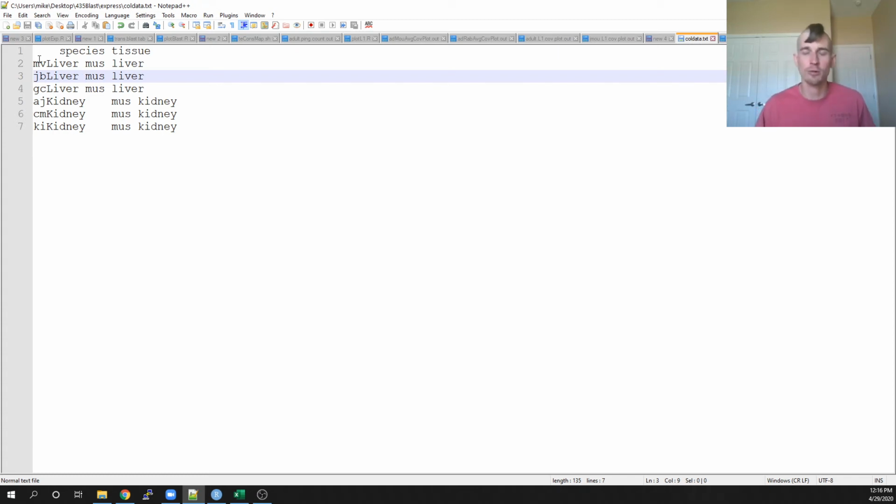Now I don't have to go looking around on NCBI for these treatment versus control groups and spend a lot of time to find that maybe only 2 or 3 genes are remotely differentially expressed, and that itself isn't very fun. But we can at least walk through this tutorial using tissues. Moving on. So we have to import this file into R.